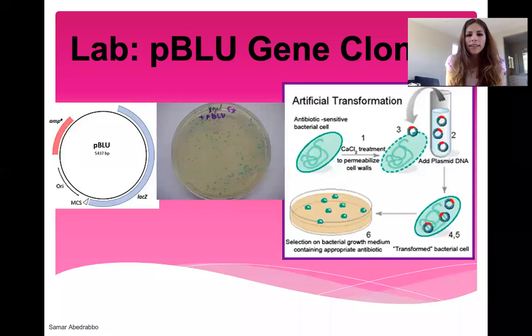Hi everyone, this is the pBLU gene cloning lab. In this lab, you're going to do gene cloning, which is a really cool, useful method used everywhere in the world in biotechnology and scientific labs. And in this experiment, you're basically going to change the traits of bacteria.